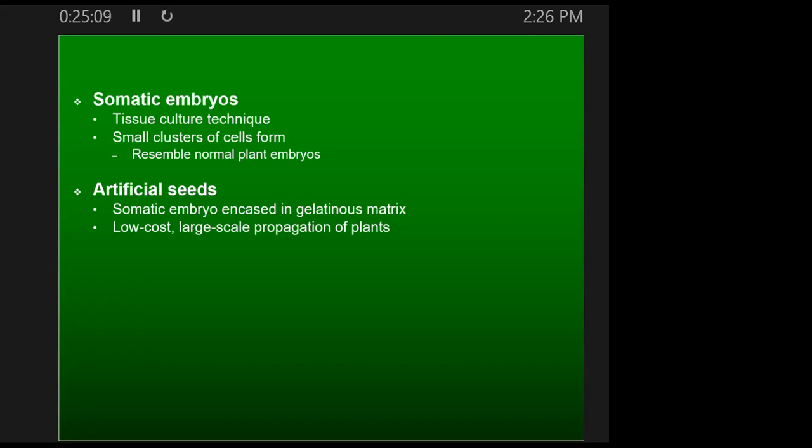And then we're also working on getting tomato seed sterilized and growing in tissue culture medium to the point where they'll create little plantlets that we can give to you, and then you'll take a stab at doing tissue culture with those. That's probably going to be a couple weeks out yet, because we have to let the tomato seeds grow for a bit.